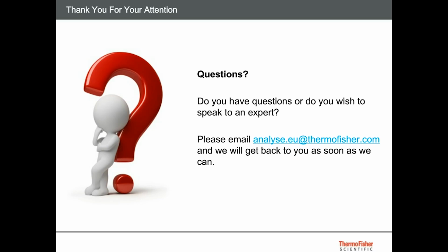Okay, we have one more question here. Can you verify that the field strength could be adjusted, and would you recommend lowering the field strength to improve the resolution? So it's 2 questions in one there. Okay, I can take this. The field strength can be adjusted either as what you would consider a steady field strength at a constant level, or as Sarah showed in the peptide mapping, the field strength can be applied to a linear gradient where you might want to lower the field strength at the beginning of an analysis, as in the example she showed, and increase it. And what that accomplishes is it maintains the peak width throughout the length of the run.